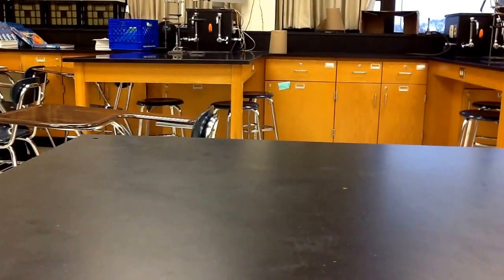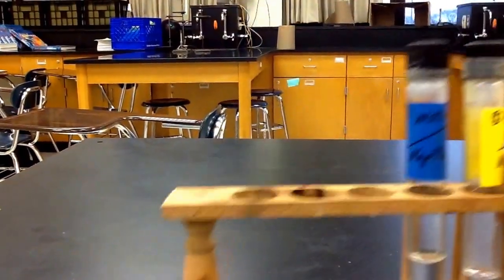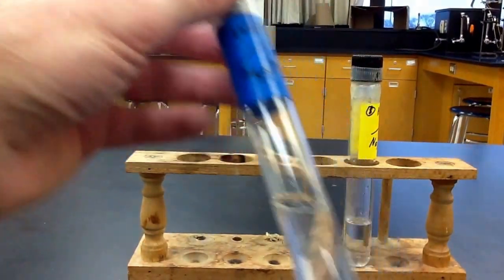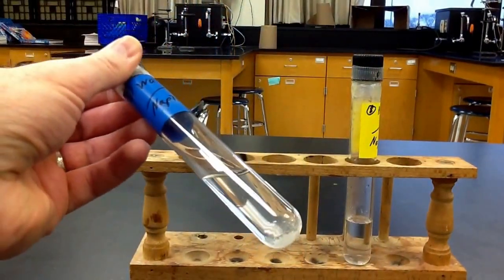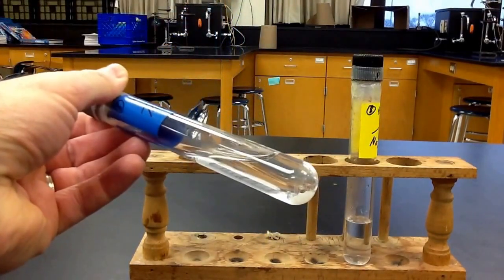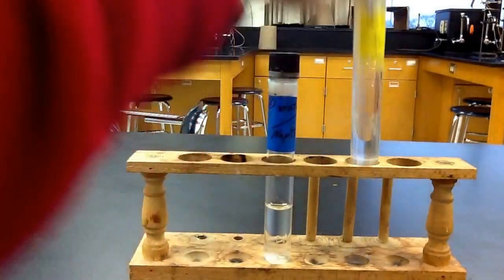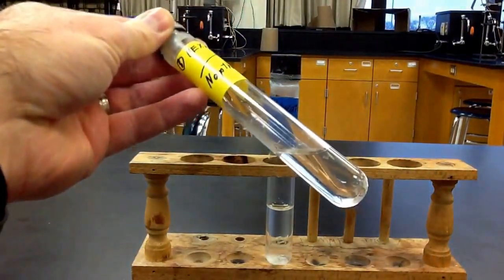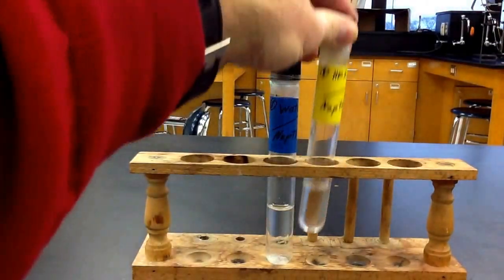And our last one is naphthalene. Some people know this as mothballs. We've got naphthalene here. We got some solid in there that will not dissolve in water. And then in hexane, though, naphthalene is soluble. We don't see any solids in there at all.